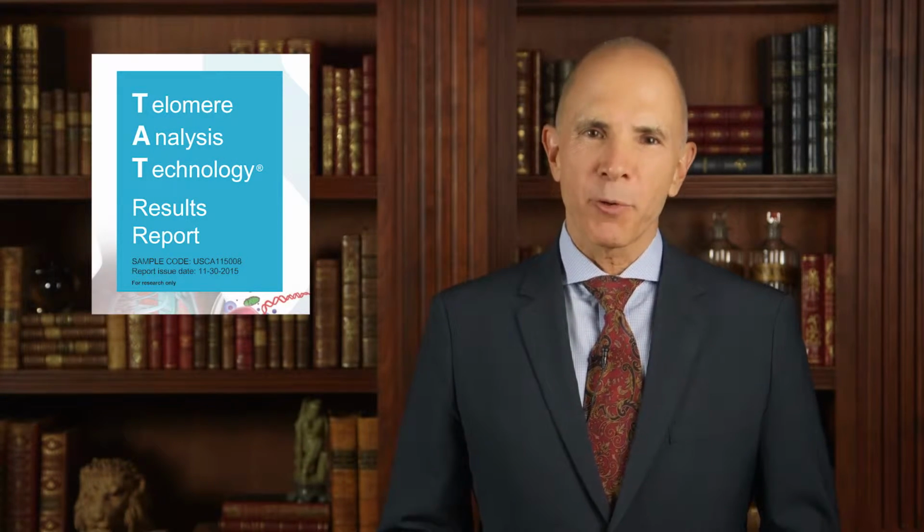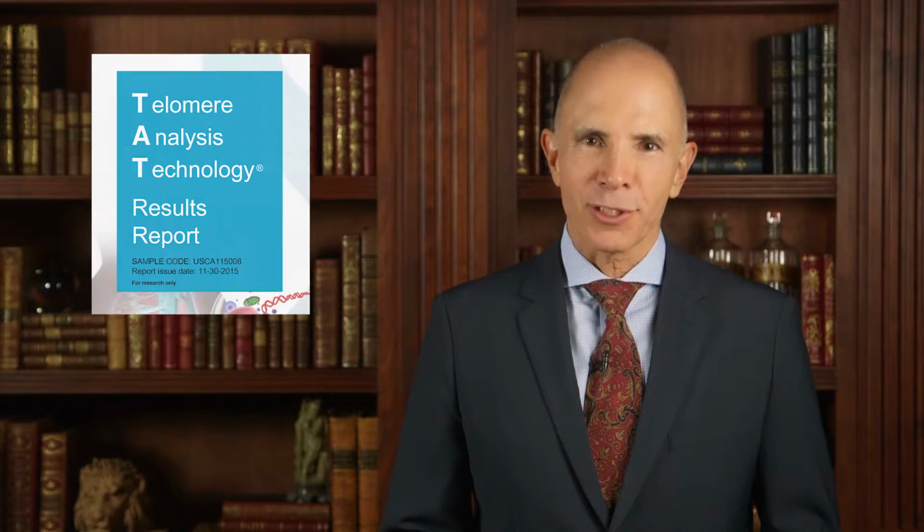In this short video, we'll be going over some of the basics of how to explain LifeLength's TAT test to your patients. We'll examine the report in some detail and also cover how best to respond to frequently asked questions. Either you or your patient has received the report electronically. You can elect to go over the report on your monitor or print it out and review the hard copy together. There are two categories of results.